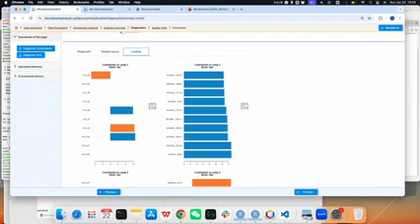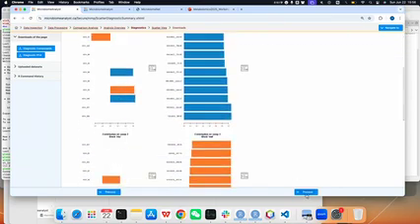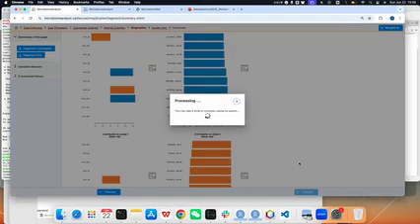These you might want to look into more, because they might be potential biomarkers. Maybe you need to align this result with differential analysis or functional analysis to see if they can really be considered as potential biomarkers. So this is the overall summary, and we go to the scatter plot.